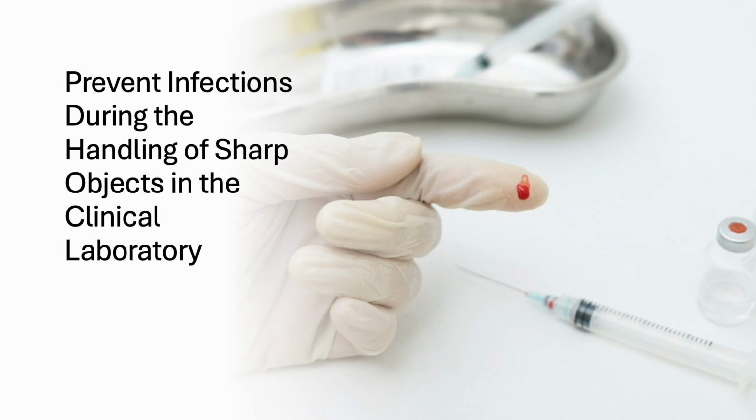Preventing needle stick injuries involves minimizing unnecessary needle use, adopting safety devices, and promoting education on safe handling practices. Healthcare professionals can protect themselves by avoiding unnecessary needle use, using safe devices provided by their employer, and promptly disposing of used needles in designated containers.